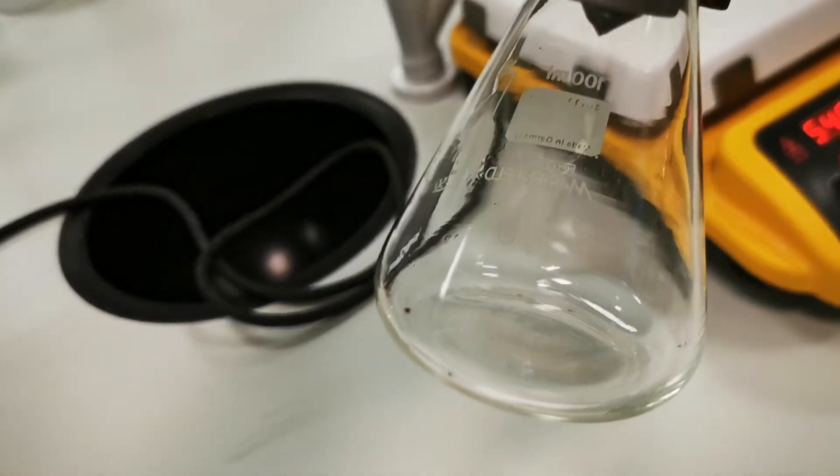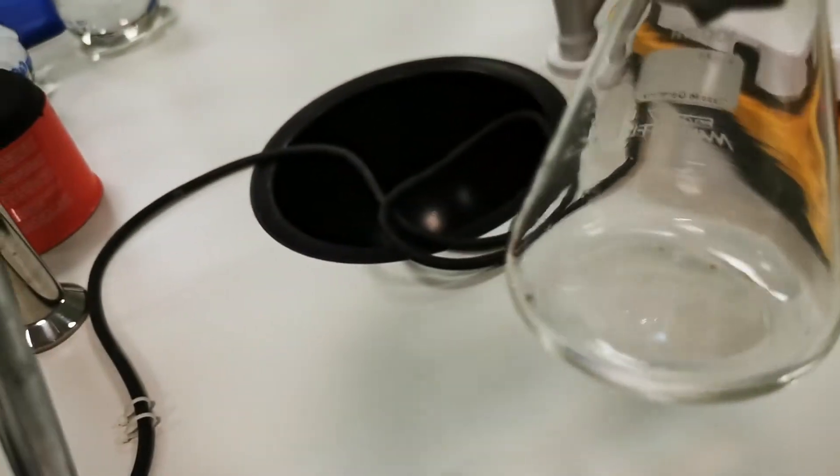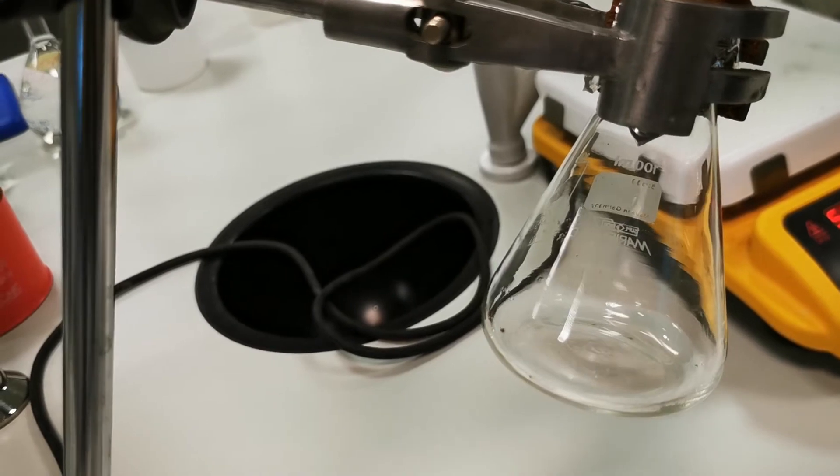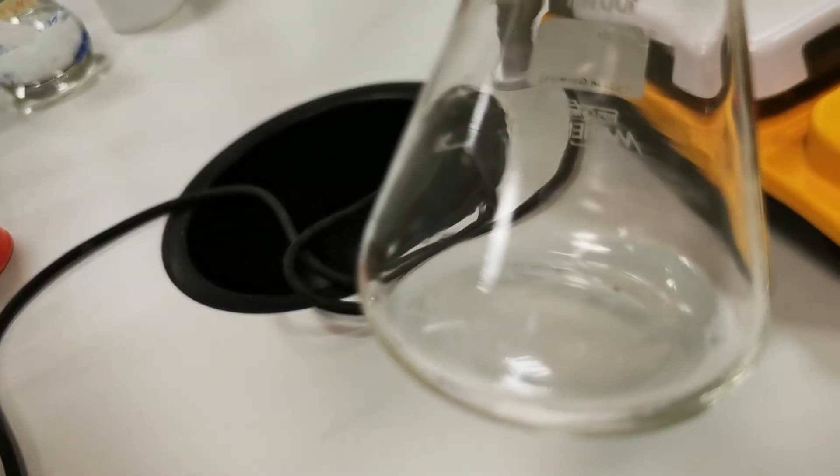As you can see now, I have some liquid in the Erlenmeyer flask. This is the gas that is, again, condensing back to liquid.